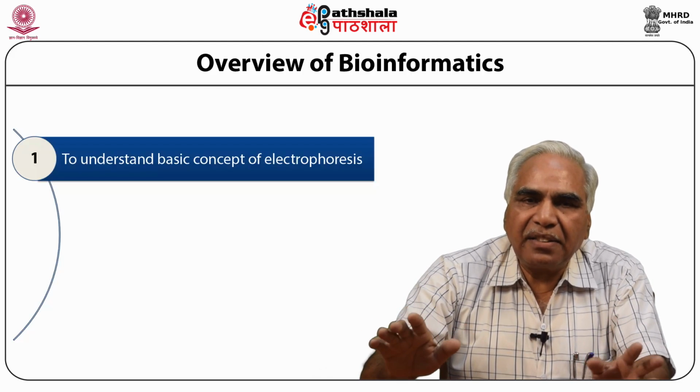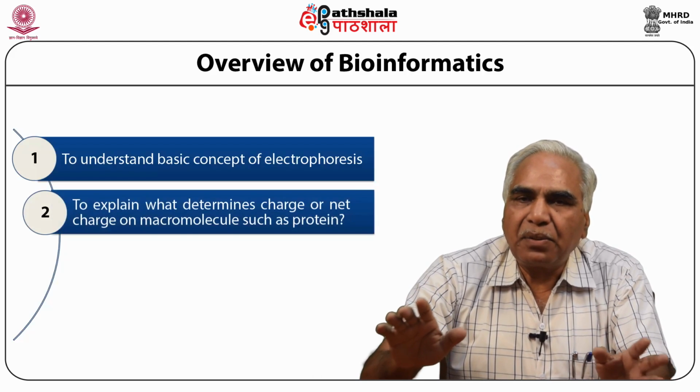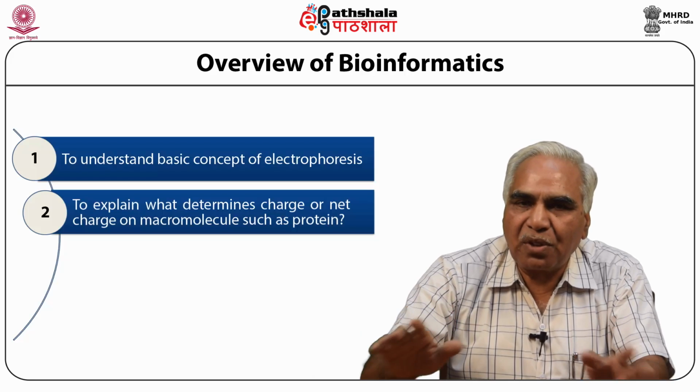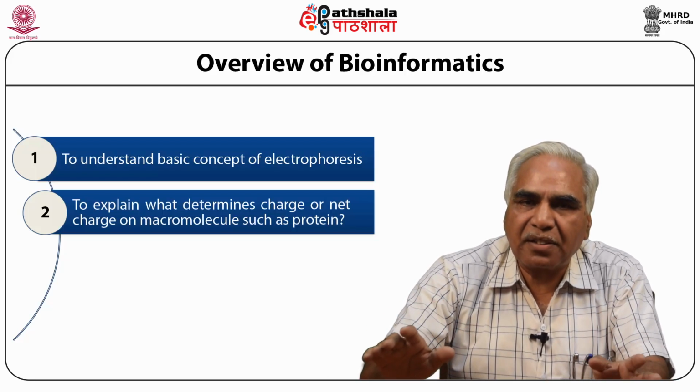Thus, in this presentation, we will also explain what determines the charge on simple molecules such as amino acids and finally a macromolecule like proteins.